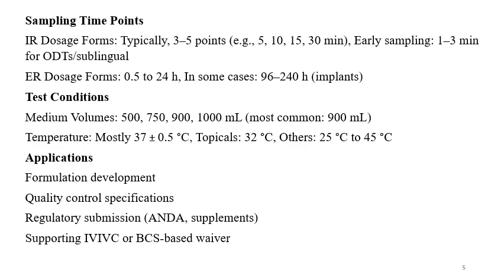Test conditions: media volumes are given, mostly 500 ml, 750 ml, 900 ml and 1000 ml, but you can find in the OGD that 900 ml is the most common media volume. And temperature is suggested for the dissolution. Mostly 37 degrees Celsius is suggested. For topicals it is 32 degrees, and others may be 25 to 45 degrees Celsius depending upon the formulation.